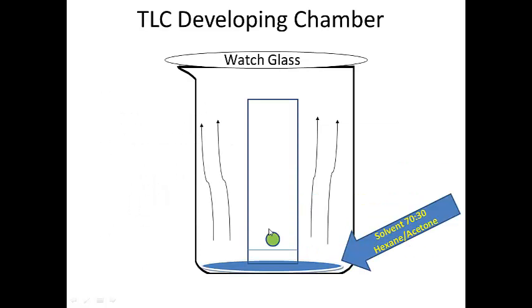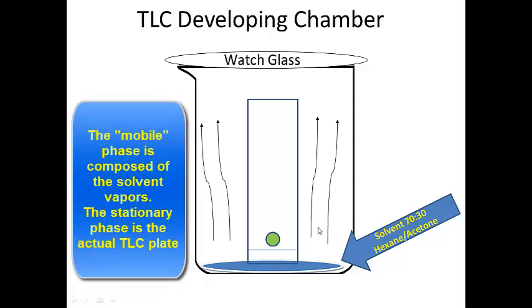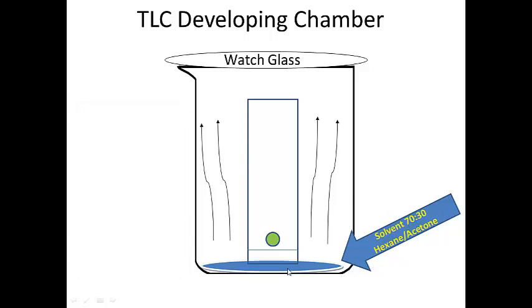Here's my compound, and what's called a development chamber is really just a beaker and a watch glass with some solvent as your mobile phase. When doing TLC you need a mobile phase and a stationary phase. The mobile phase is the solvent vapors and the stationary phase is the silica gel. At the bottom of your development chamber you're going to add some 70:30 hexane-acetone, which will already be made up.